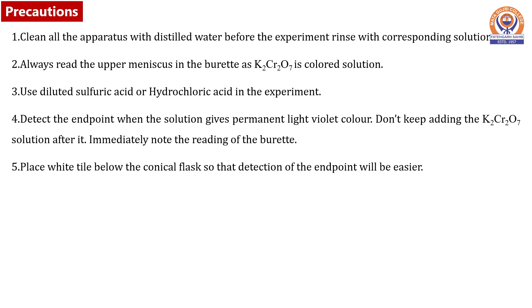In order to make the detection of the endpoint easier, place a white tile below the conical flask.